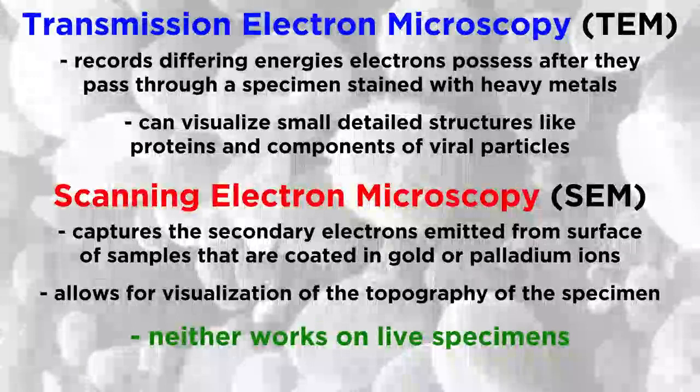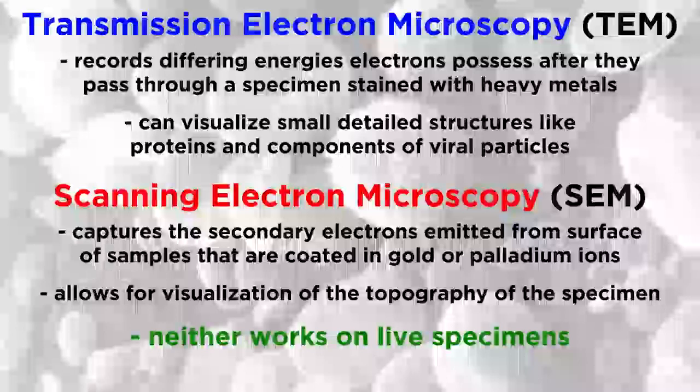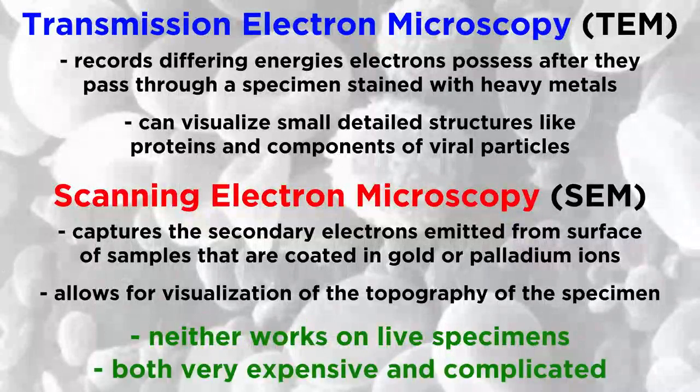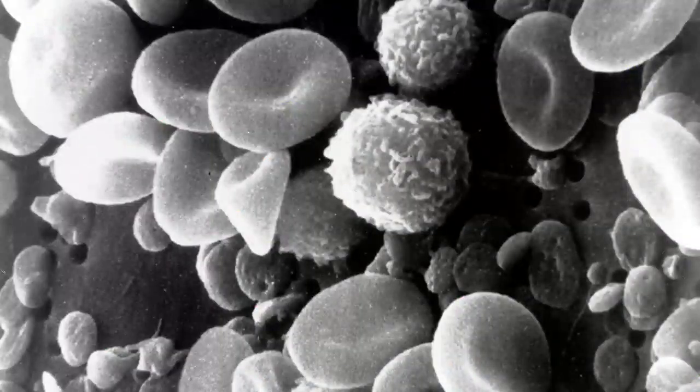And the main drawback, as we mentioned, is that both SEM and TEM cannot be used to visualize living specimens, and they are also quite expensive and complicated techniques to use. And with that, we know a bit about electron microscopy.